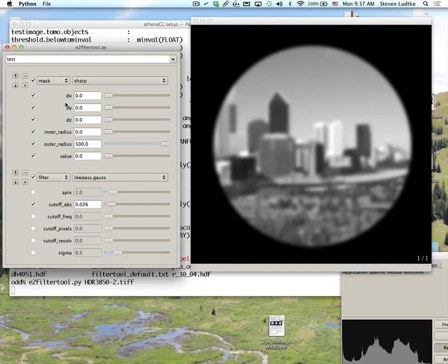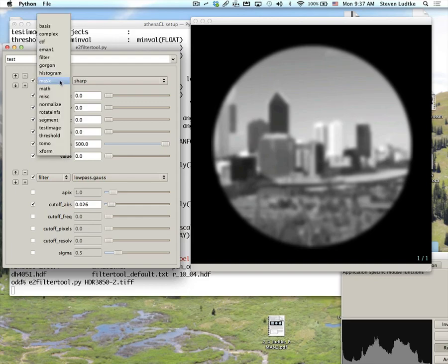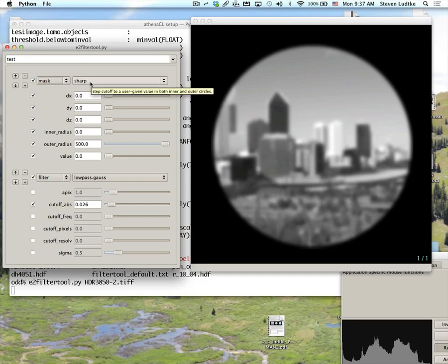Okay, so I'm not going to take you through all 176 or something like that operations, but I'll just show you that this tool exists, and this is a very good way of preparing for writing your program in Python. So you can look at this and you can decide which sequence of filters you might want to use, and then you can write a program to actually implement them.